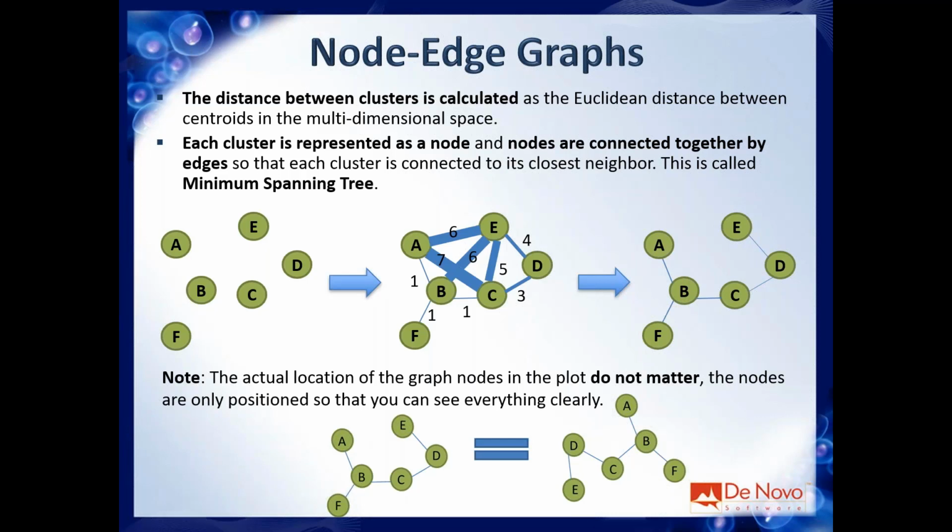It's very important to keep in mind at this stage that the overall shape, the aesthetic of the tree, is just aesthetic. It doesn't matter. The only thing that matters here is the way in which nodes are connected, so whether or not a node is connected to another one. And you can clearly see this at the bottom.